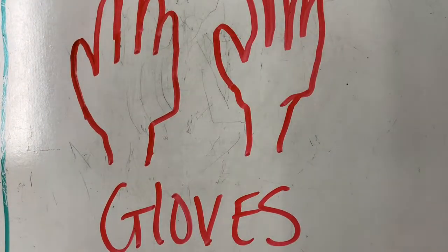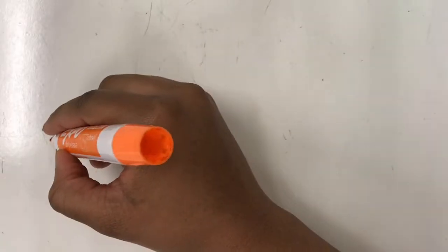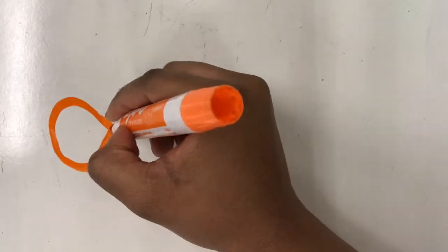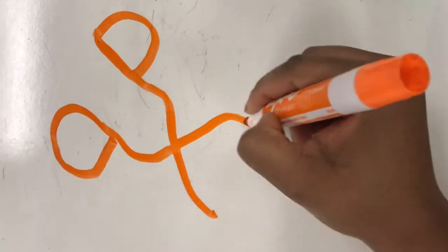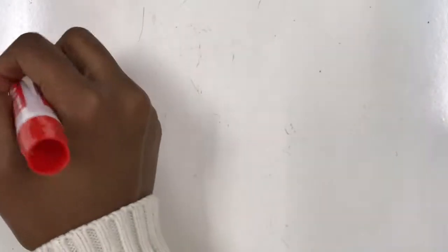When spilled on a surface, the liquid nitrogen tends to cover it completely and intimately, cooling a large area. Use tongs, preferably ones with insulated handles, to withdraw objects immersed in the liquid and handle the object carefully.